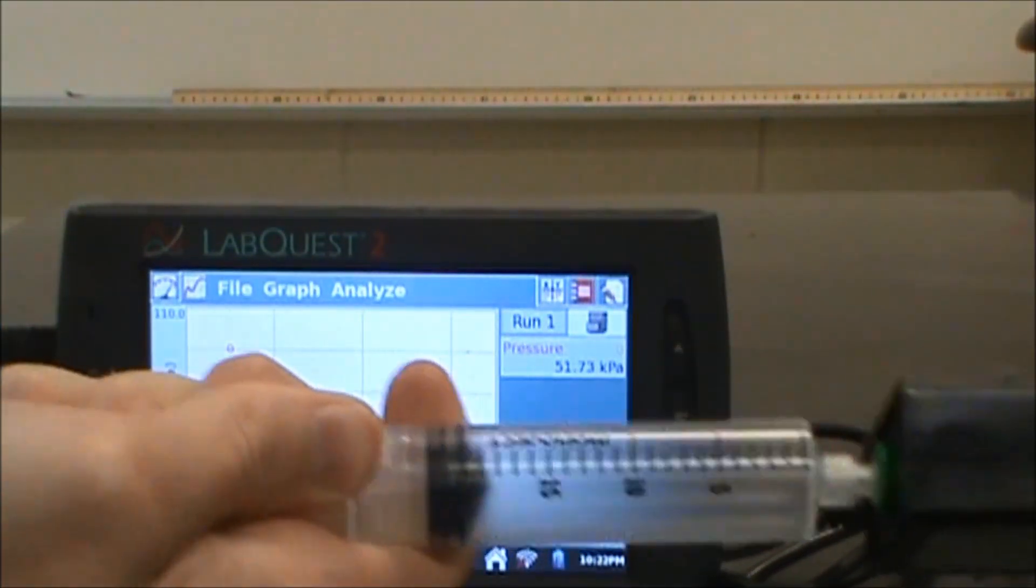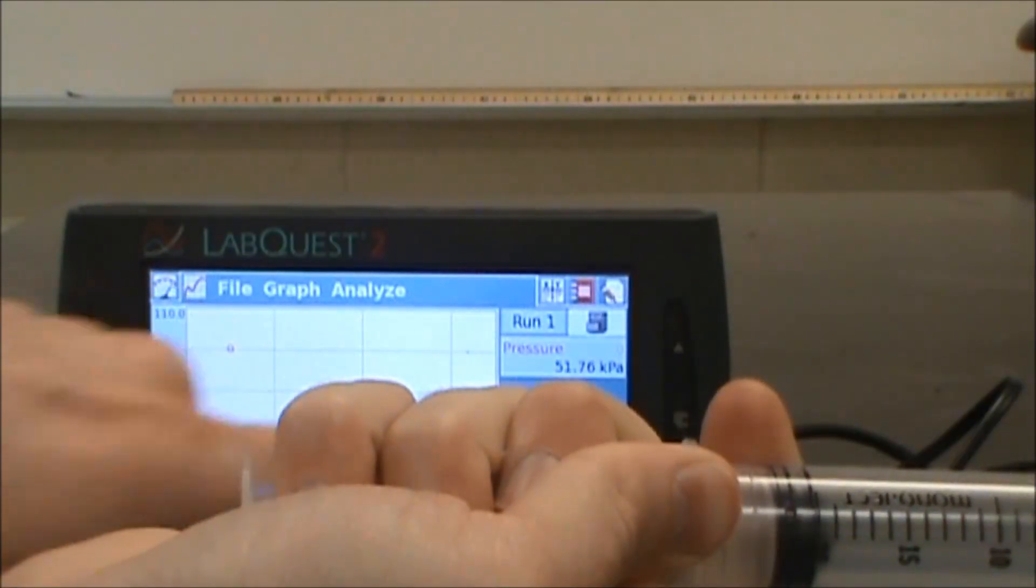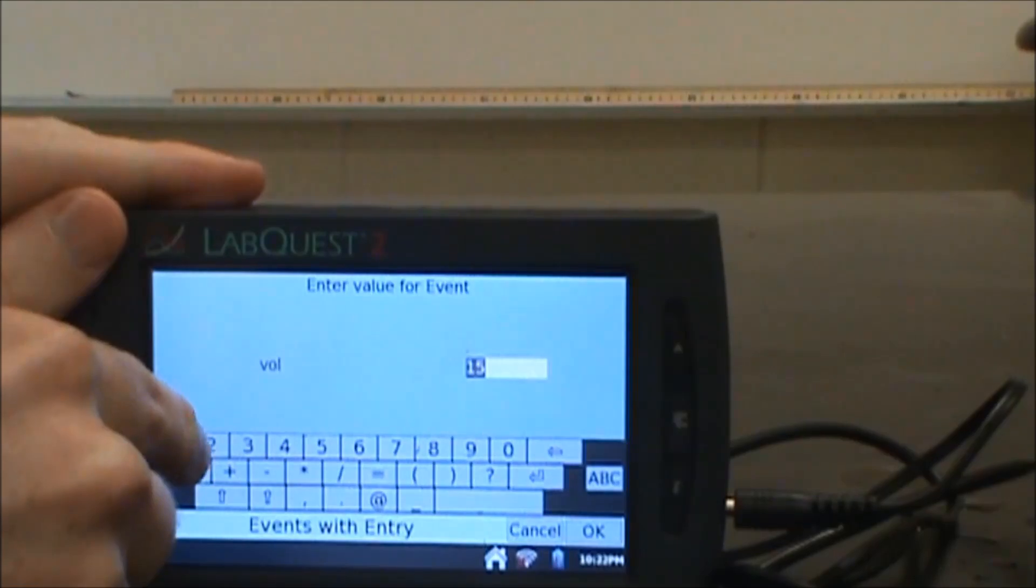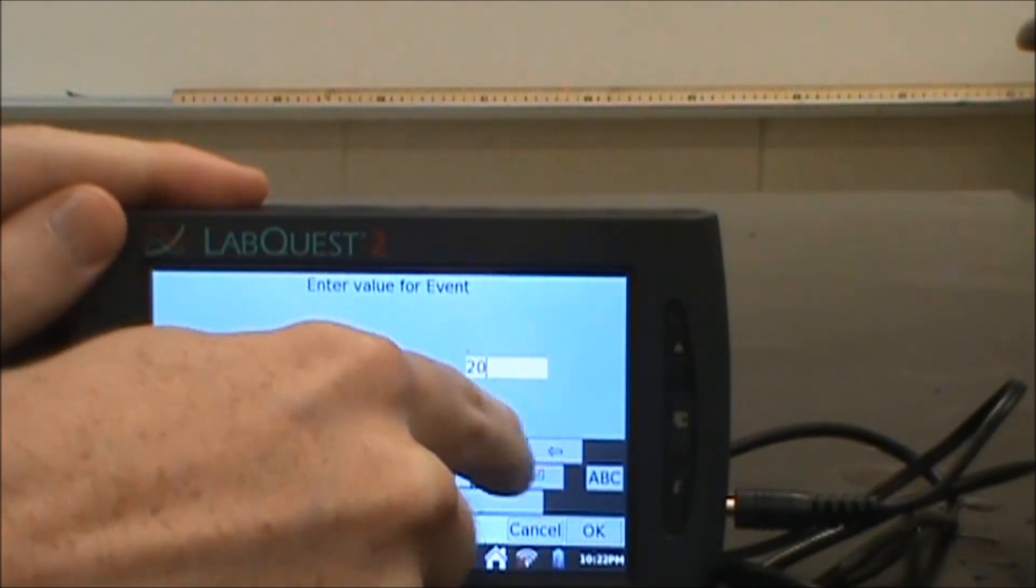I'm going to take this back to 20 now. There's my syringe. I'm going to wait for my pressure to stabilize here. Then I'm going to hit keep. I can let it go. I can put in that it was at 20 milliliters.